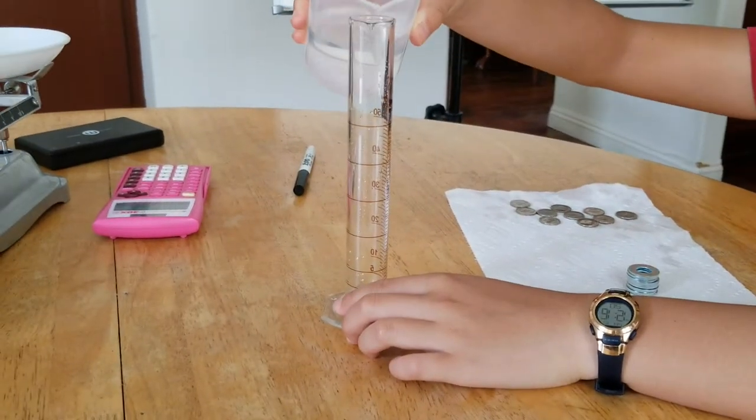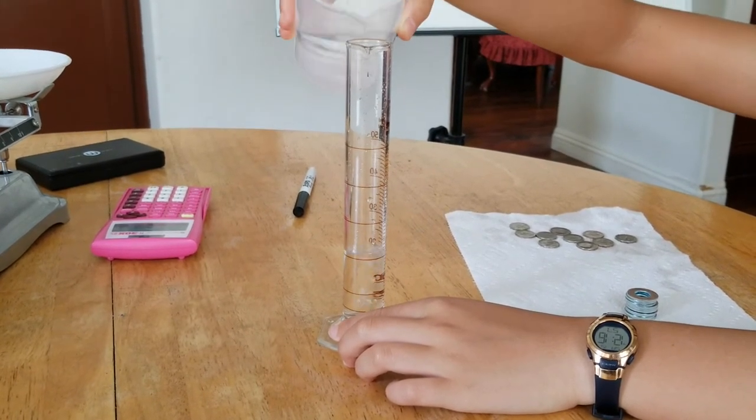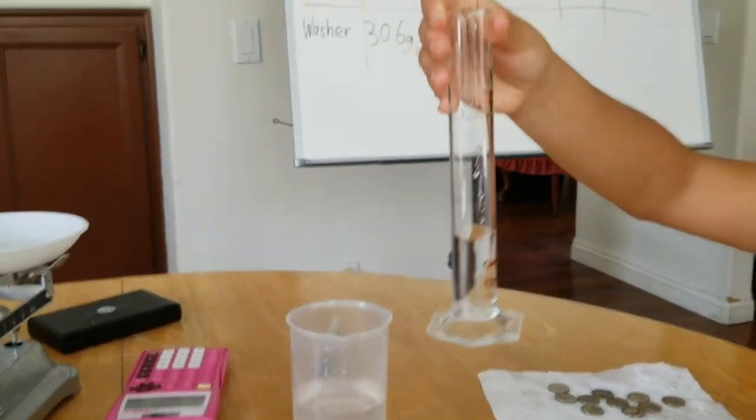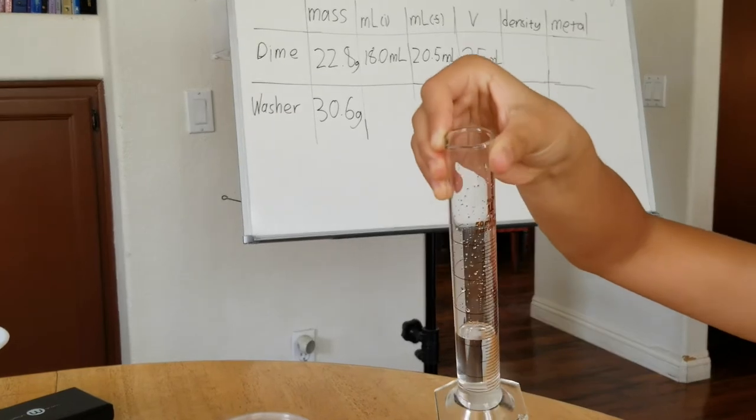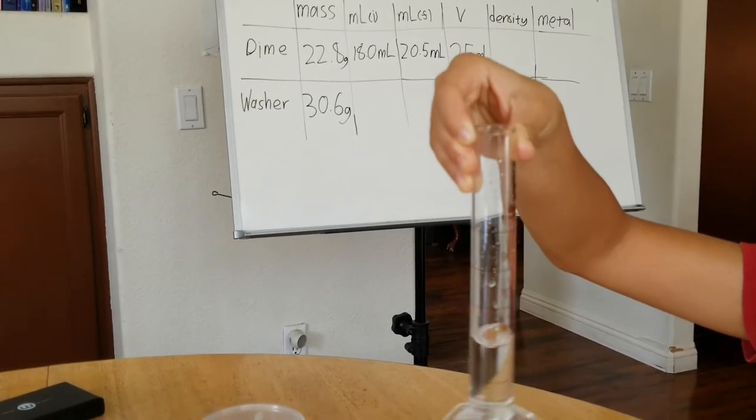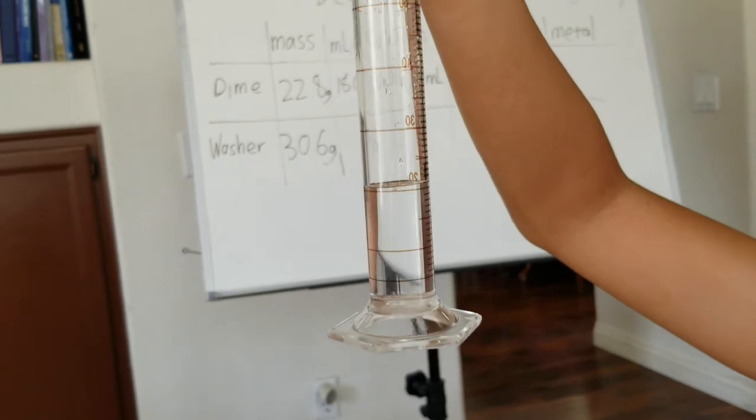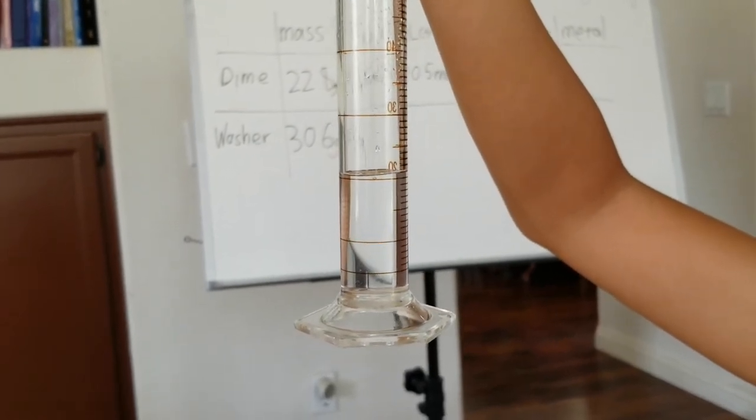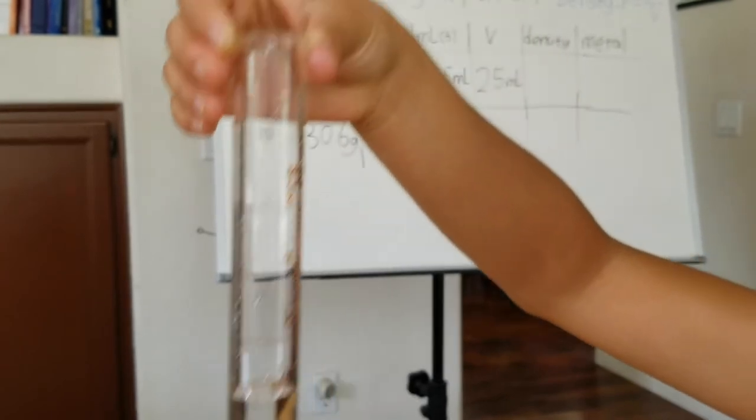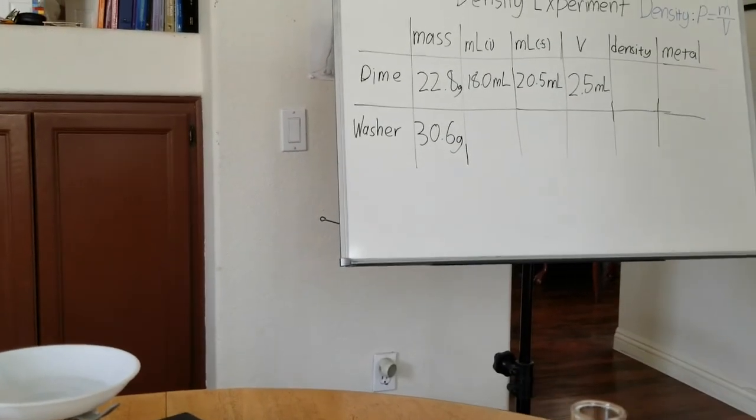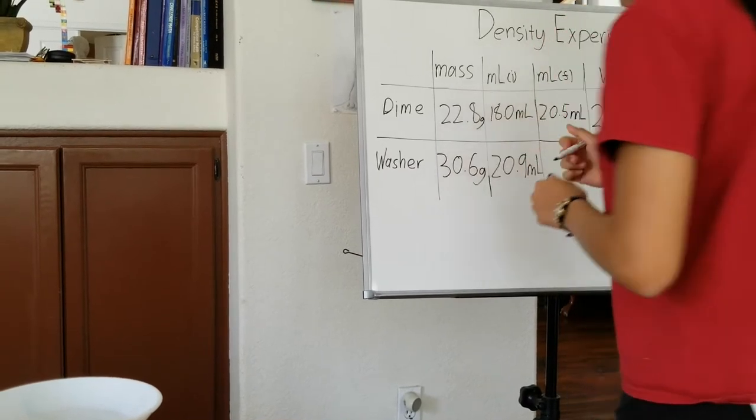That's easy, 20.5. So once again, roll it, get the air bubbles out. There's still air bubbles. Right now we are about 20.5. Right now the curve is at 20.9. So this is the volume, 20.9.